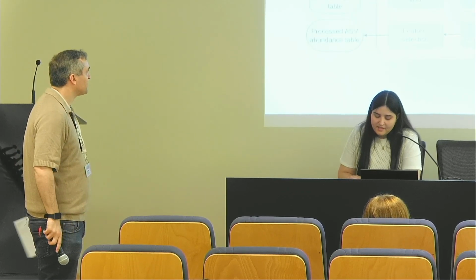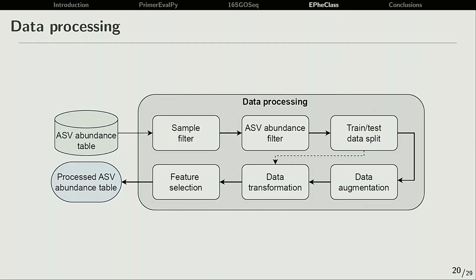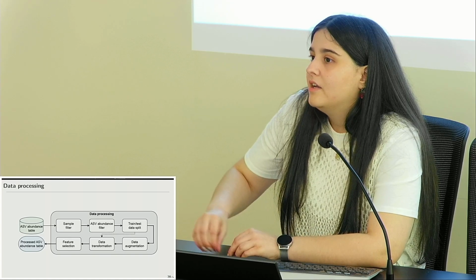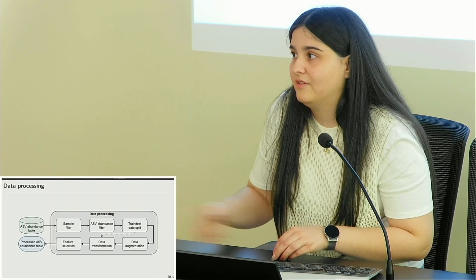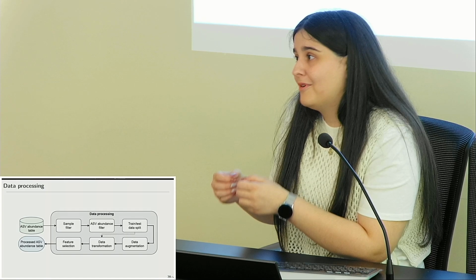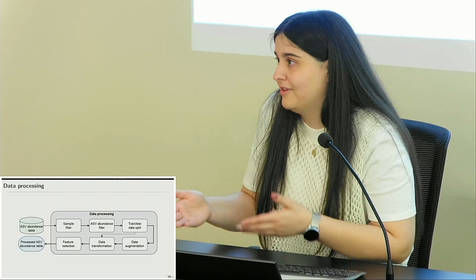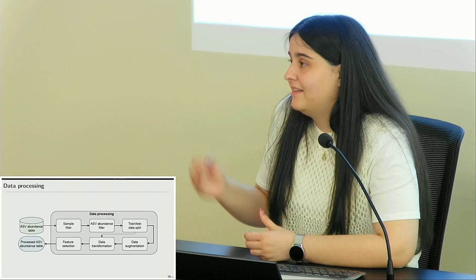So here, we actually used an algorithm called compositional CutMix, which, when creating new data points, makes sure that the new samples also follow a compositional nature. So when we add up all the relative frequencies of each ASV, it still adds up to 1. I cannot exactly tell you now how the algorithm works, because we used this recommended one, usually used for compositional data, but that's the principle behind it, to maintain the compositional nature.